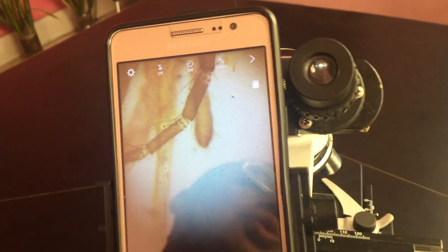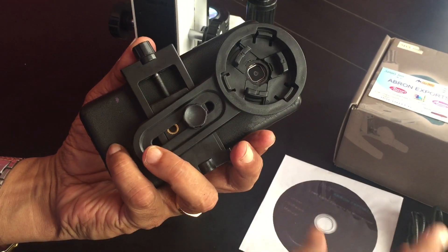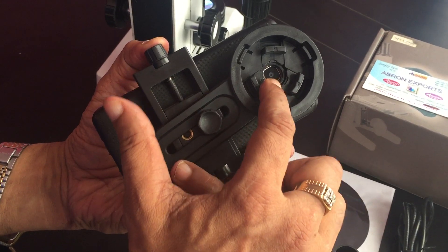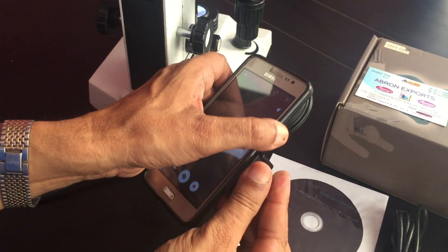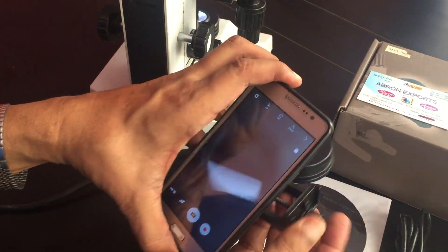First of all, there is an adapter. This adapter is there for holding the eyepiece, then the camera is to be made in the center. This angle is there, and then the holding for the camera is there. You can just open it and put these in the body.